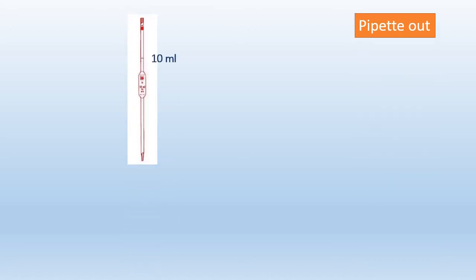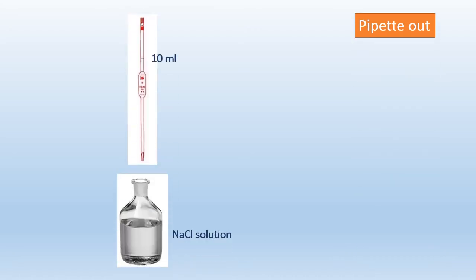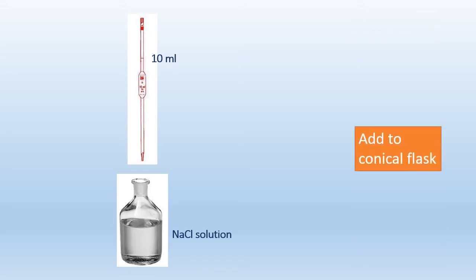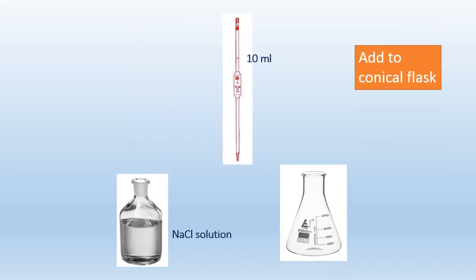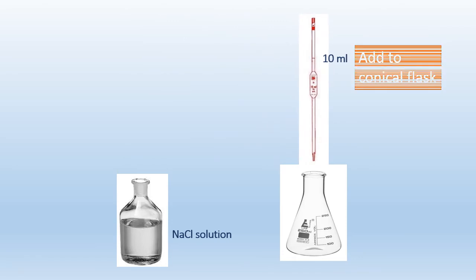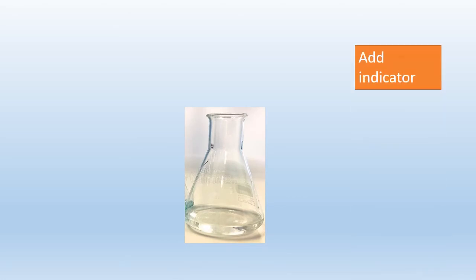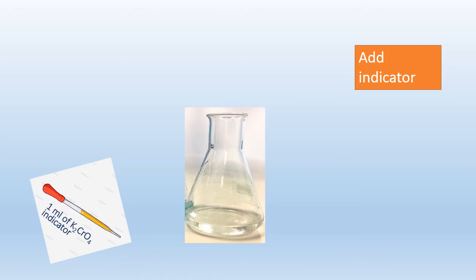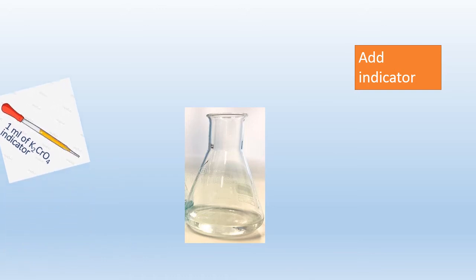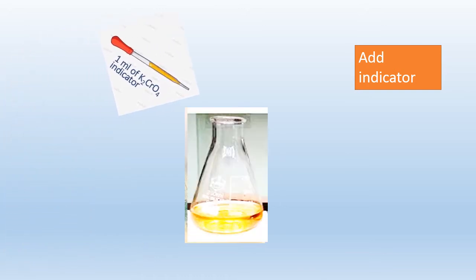Pipette out 10 ml of NaCl solution into the conical flask. Now add the indicator — 1 ml of potassium chromate indicator. On adding that, the solution turns yellow in color.